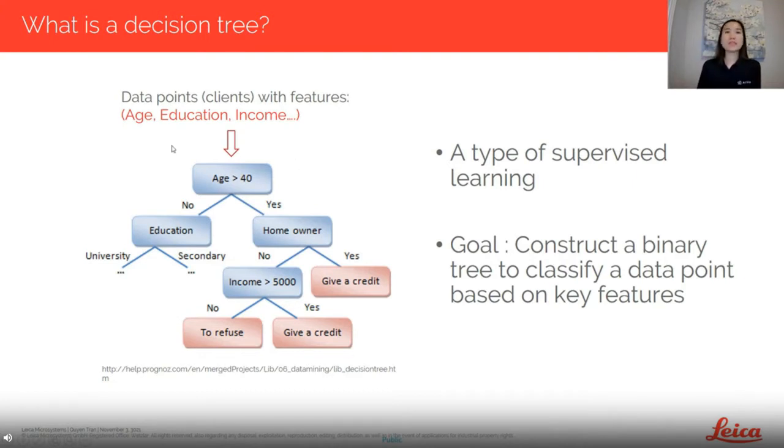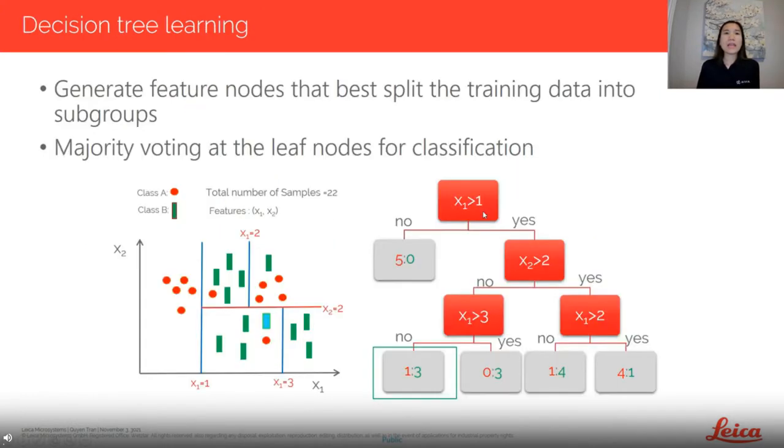So this is one decision tree composed of this set of features to provide a way to classify this particular application. Now, in the learning process itself, each of these features essentially gets a vote, and the majority of the voting of these features determines the classification and the output of this particular tree.